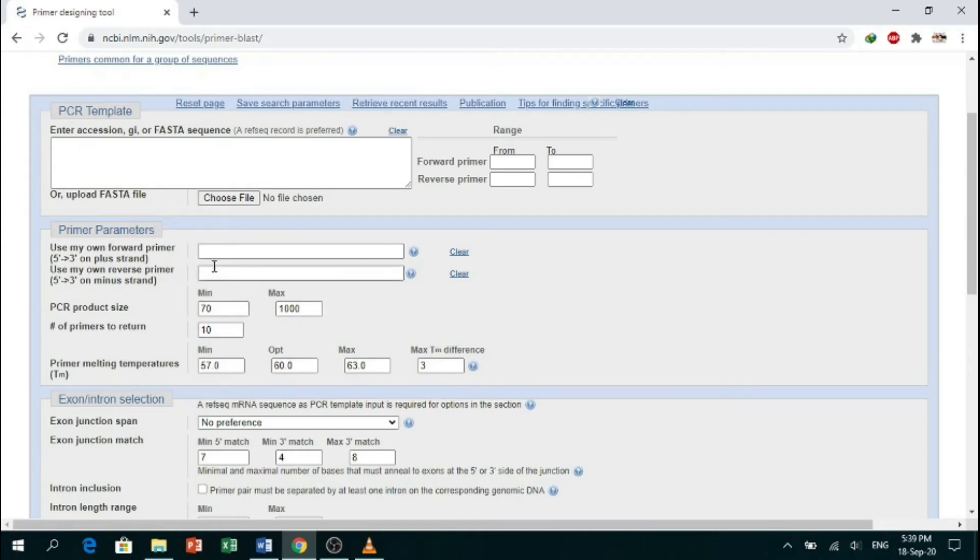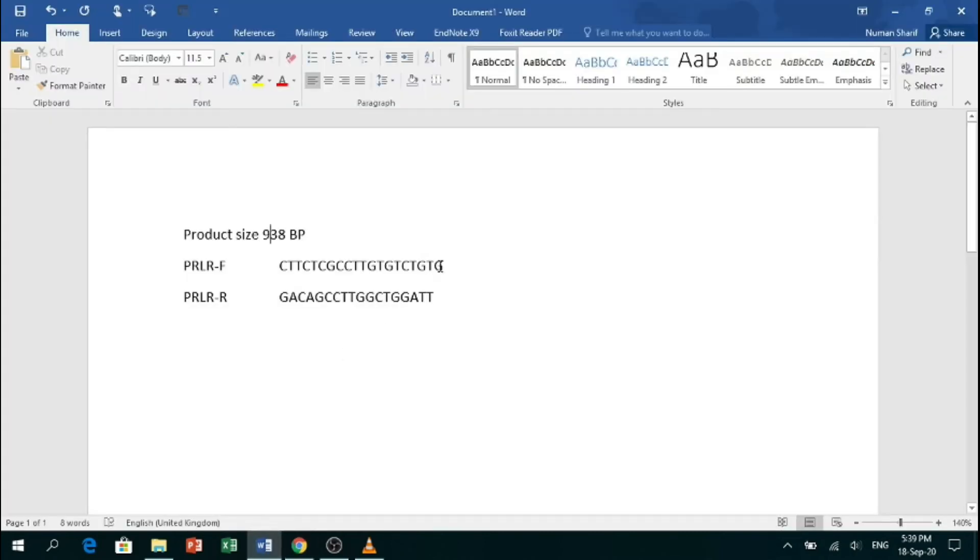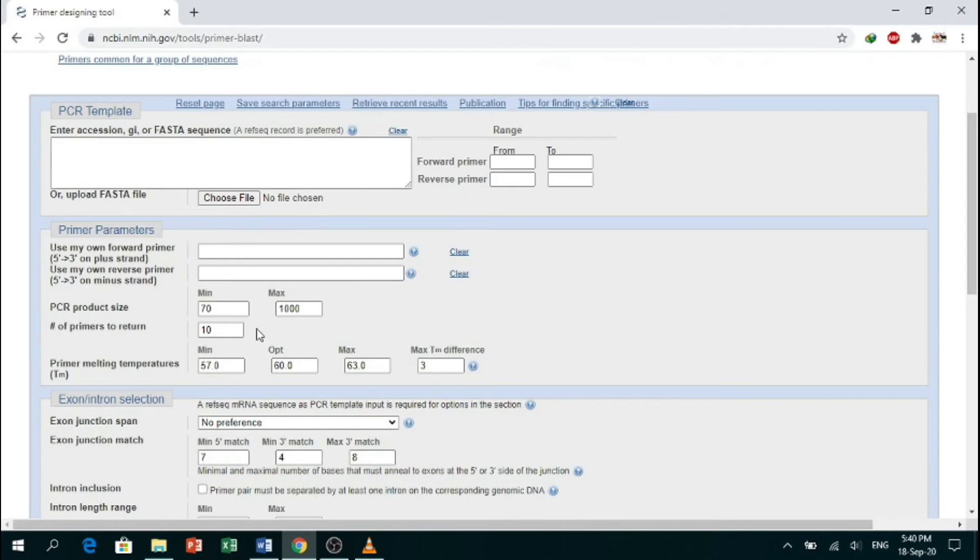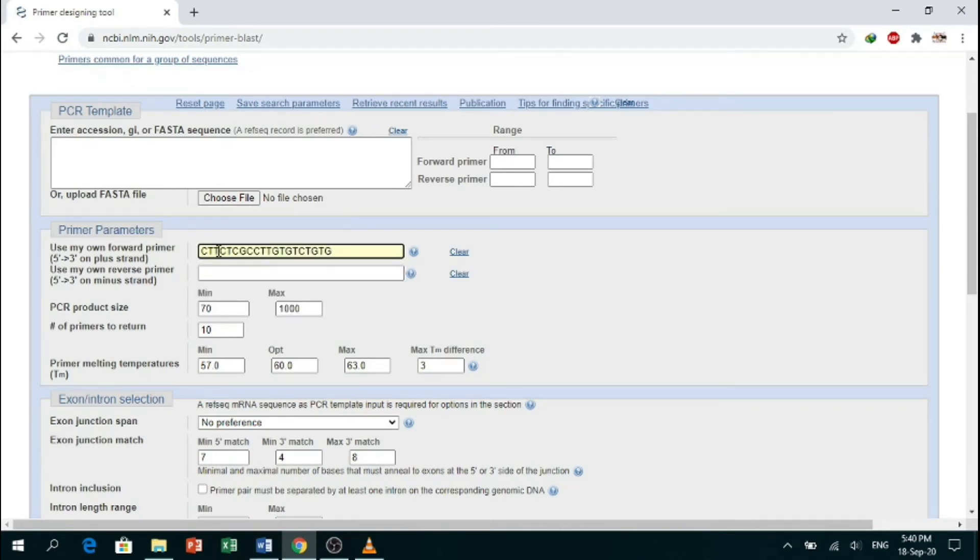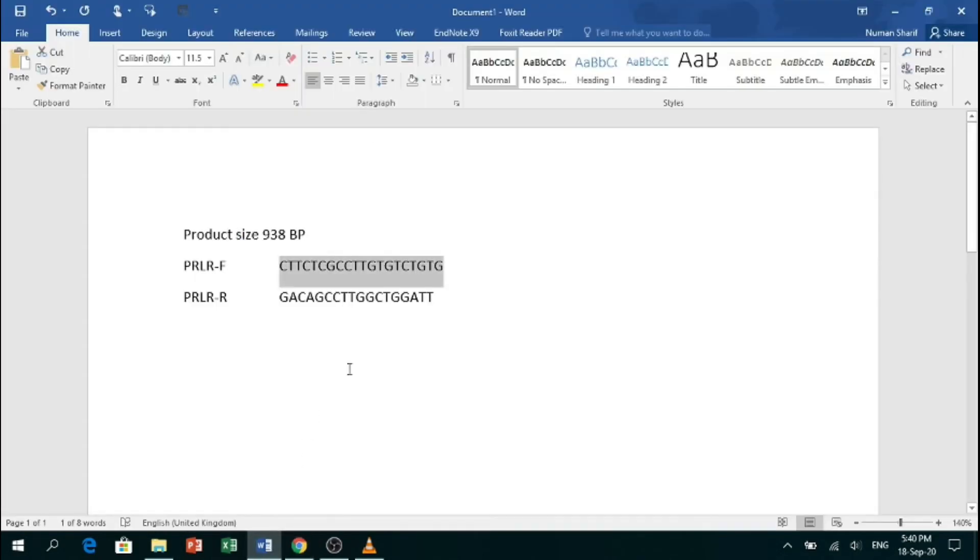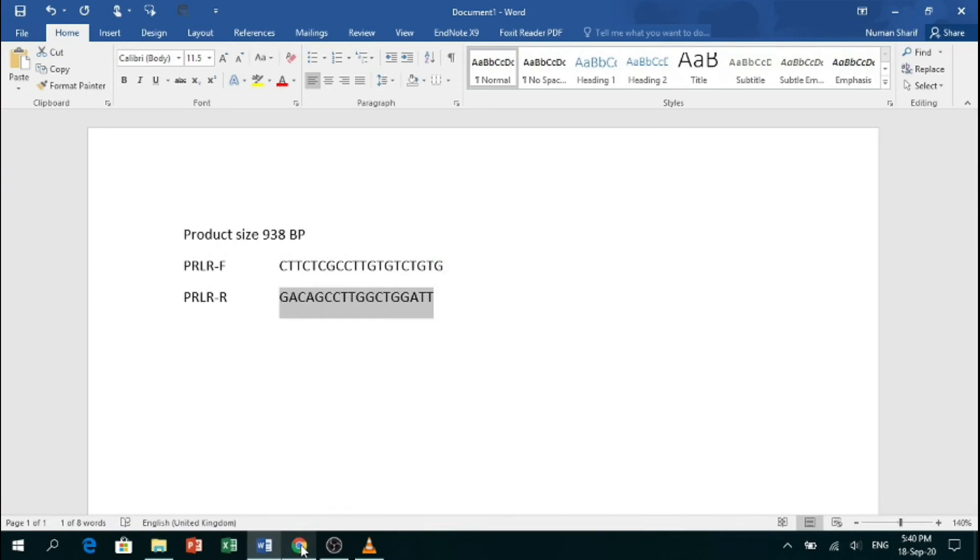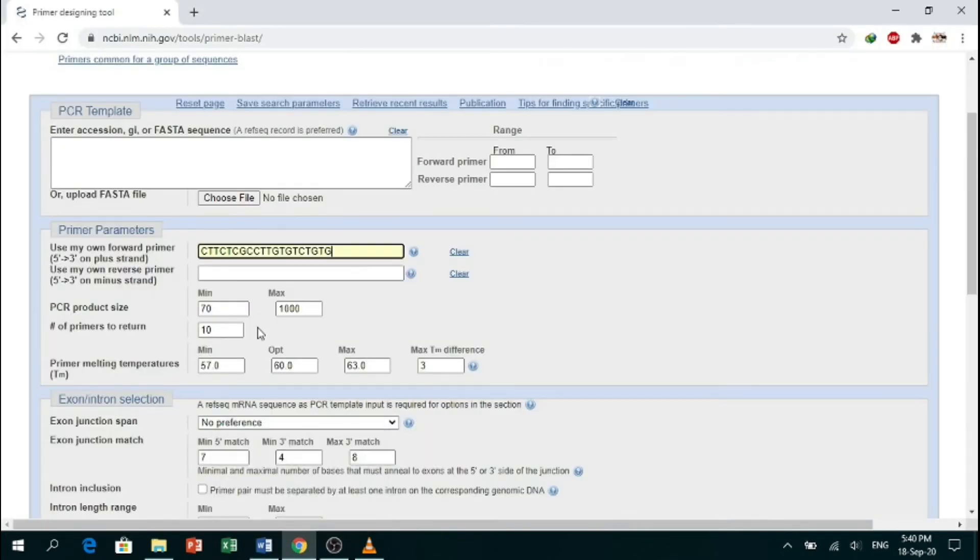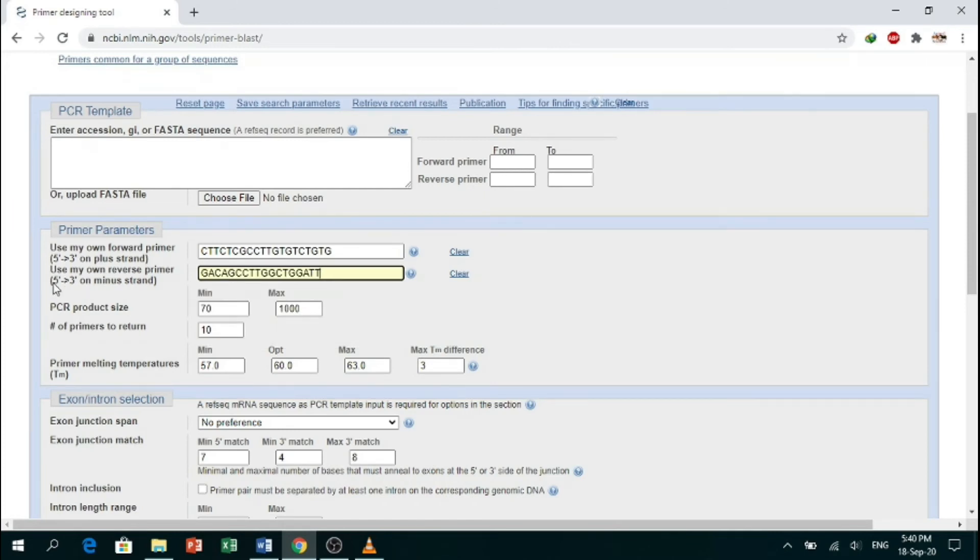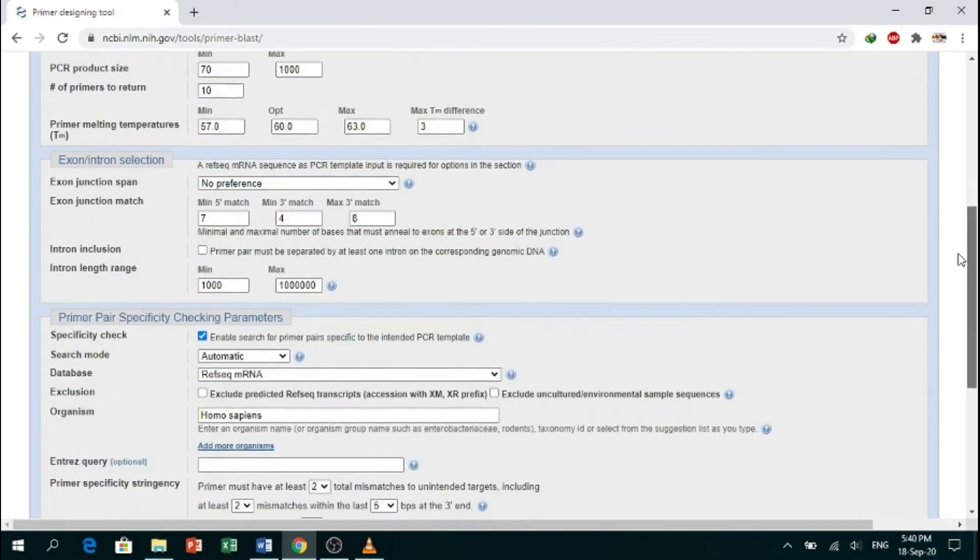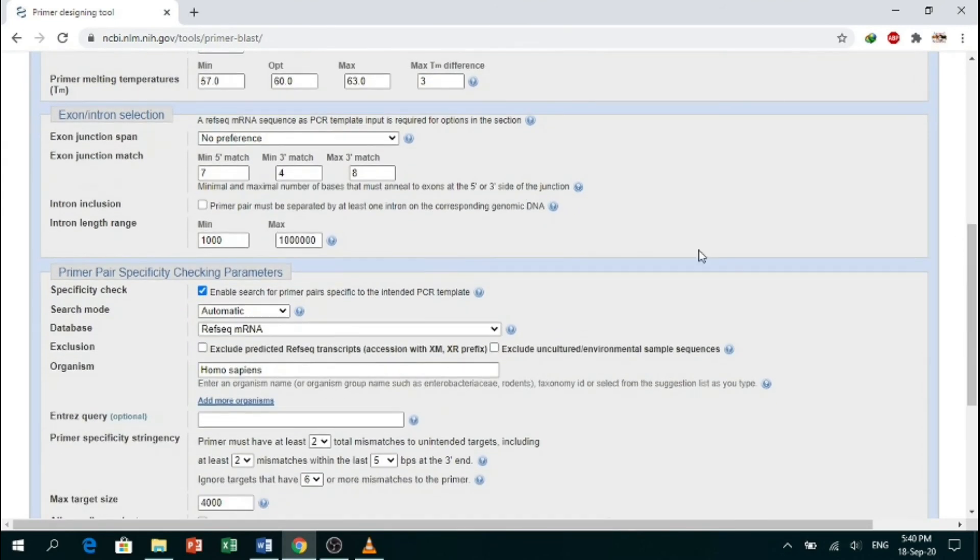Here you will paste your own forward primers. So copy your forward primer and paste it to that box. Same with the reverse primer—copy it and paste it in the box for reverse primer.